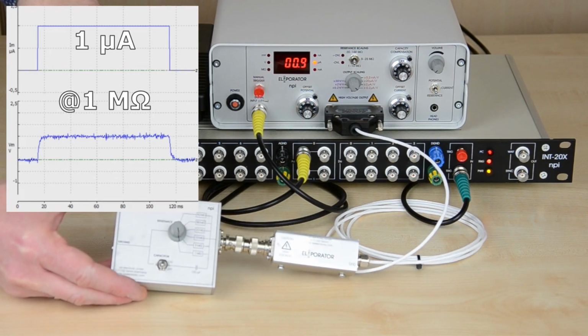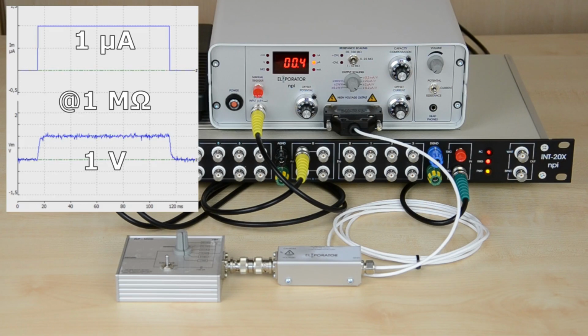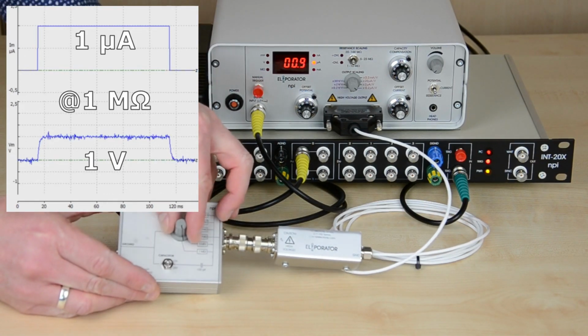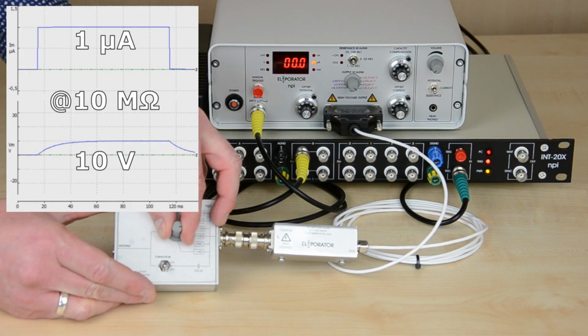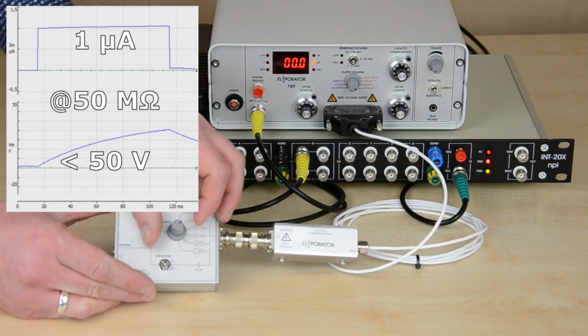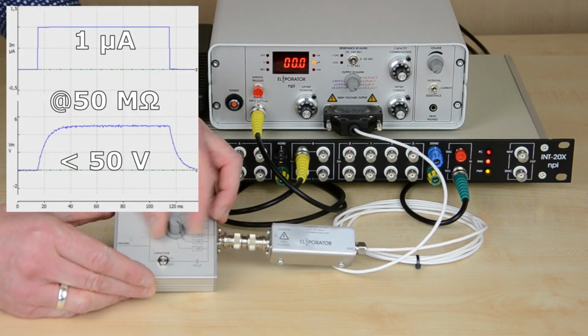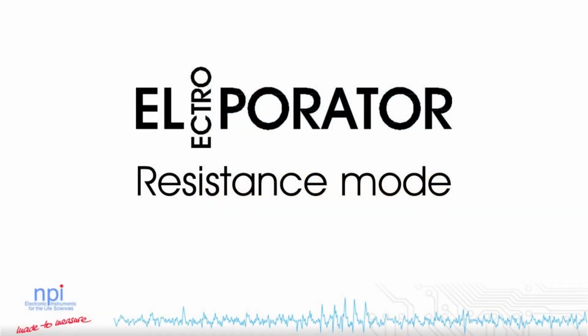With the model cell set to 1 megohm, this results in a voltage pulse of 1 volt. Changing resistances at the model cell will change the output voltage accordingly. Note that the voltage signal is slowed down by the capacitance in the model cell, marked here in a red circle. This can be compensated with capacity compensation.